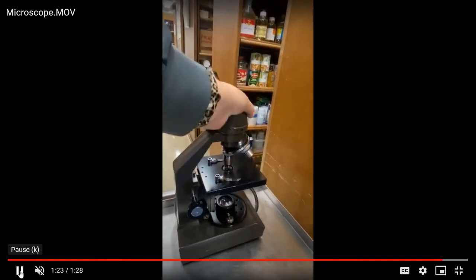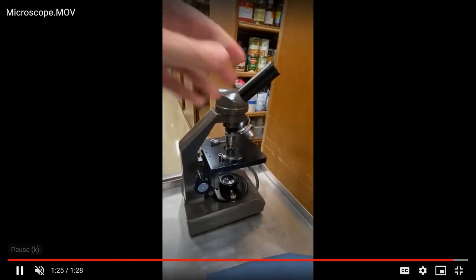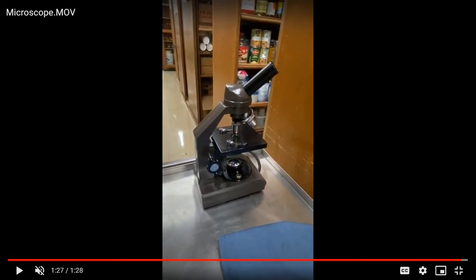Also notice that the eyepiece up at the top does rotate. So if you find something really cool under the microscope you'd like someone else to look at, you don't have to move your entire microscope. The eyepiece can just move so that others can view it.